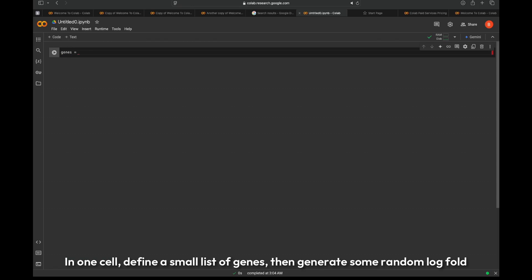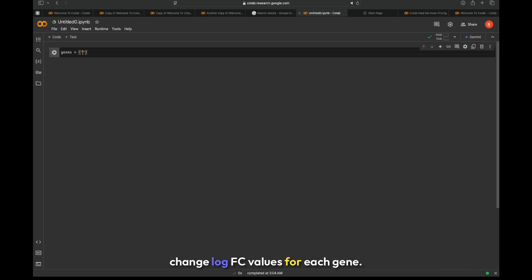Let's start with an example. In one cell, define a small list of genes, then generate some random log fold change (logFC) values for each gene.